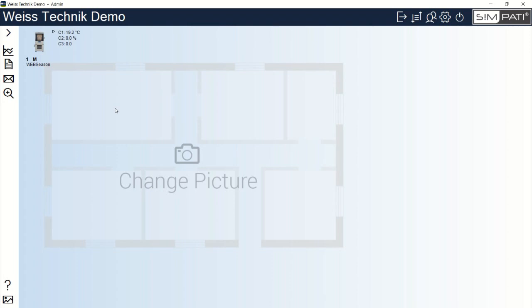What you see before you is the main SIMPATI screen, and you can see we already have one chamber loaded into the software. These values aren't going to match a real chamber, as this is just a dummy controller we have in-house, but it's still good for tutorial purposes.